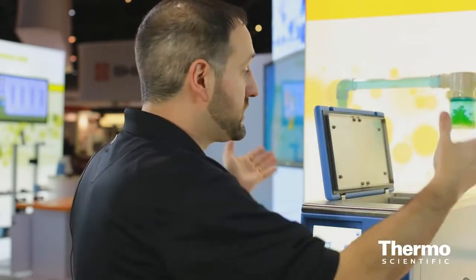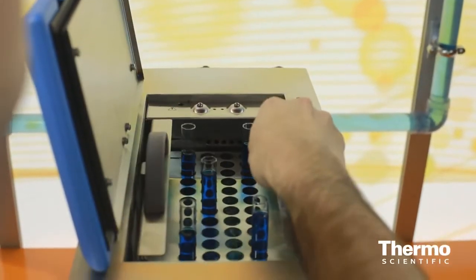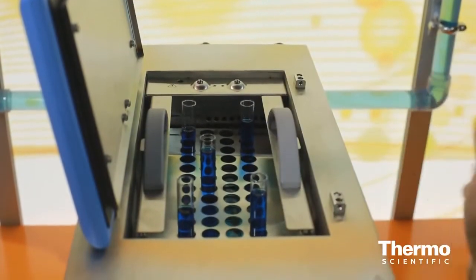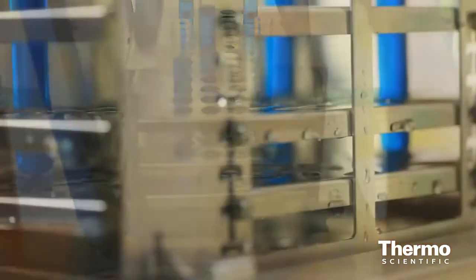Or, as I mentioned, if there's a tight lab space and you can only open it in one direction. One of the other cool features is you can put your samples in the bath, run your application, but now that you're done, you just bring it up, and they stay right there.